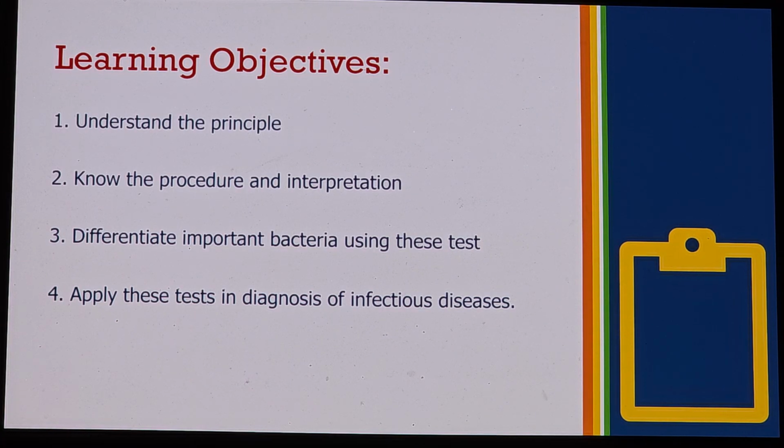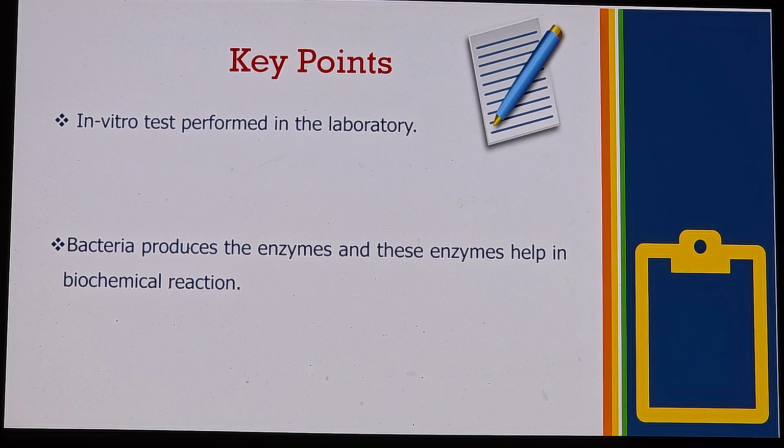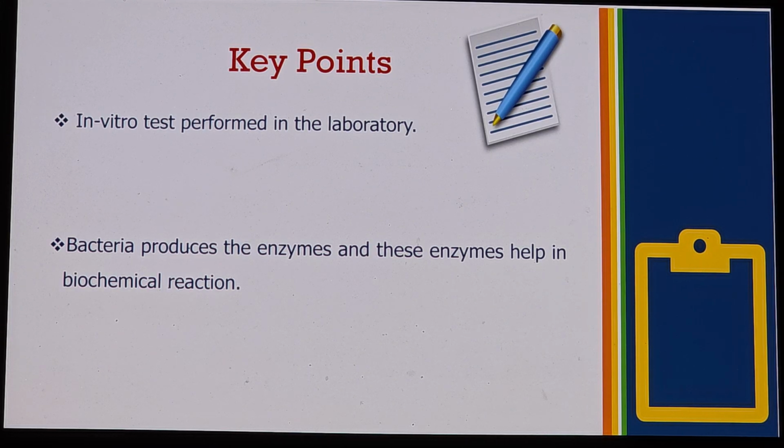First, understand the principle, know the procedure and interpretation, differentiate important bacteria using this test, and apply this test in the diagnosis of infectious diseases. What are the key points? All the biochemical tests are in vitro tests mainly performed in the microbiology lab. Bacteria produce enzymes, and these enzymes help in the biochemical reactions. I will discuss all the biochemical tests one by one.